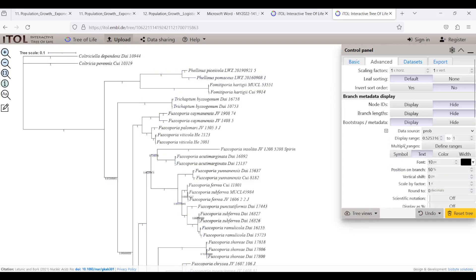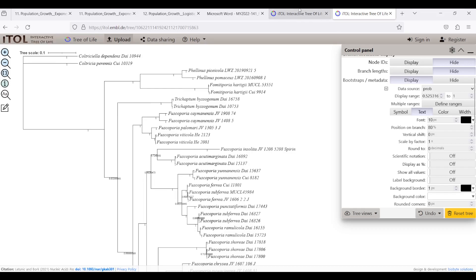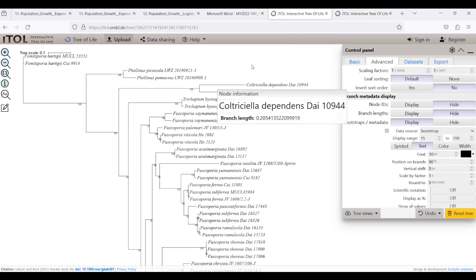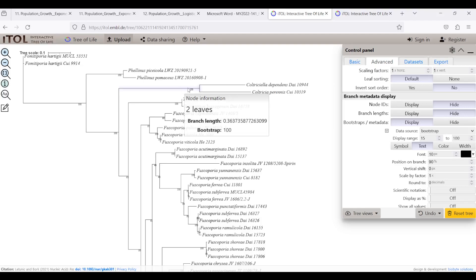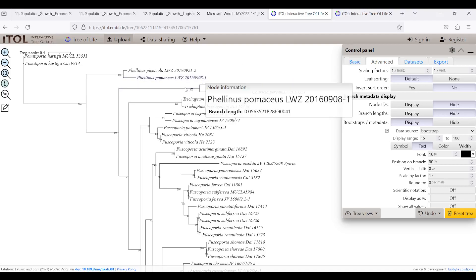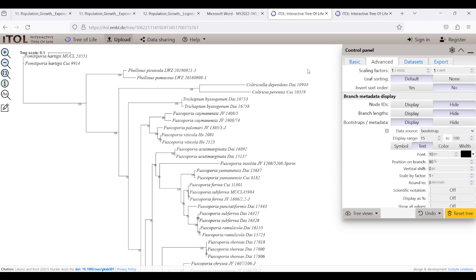The only difference is that this value is the Bayesian posterior probability. So how are we going to make a tree with both types of values? This process will take a little longer, but it is much faster than editing in Photoshop or other methods, and more accurate. We will do this in the iTOL website.